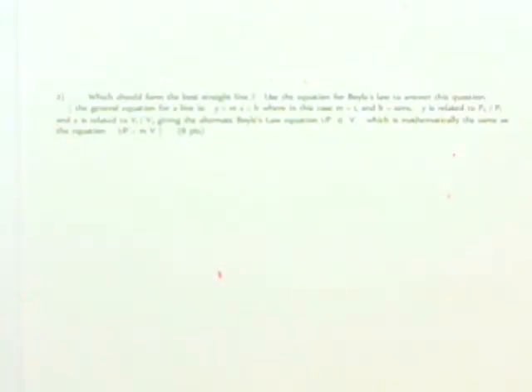Okay, so our next part of the lab report form is actually going to be some questions, and I'll discuss those in a minute. All right, but we're going to actually now start with part 2 of your lab that you're doing today. So part 2 is the ideal gas law part. Let me zoom out for a minute. All right, so part 2 is your ideal gas law.